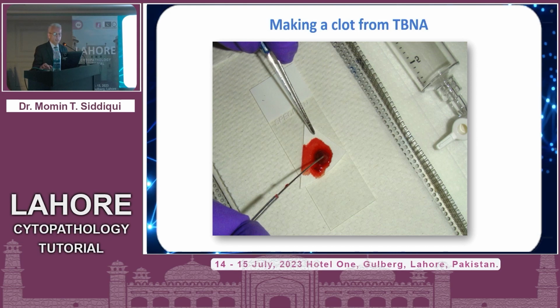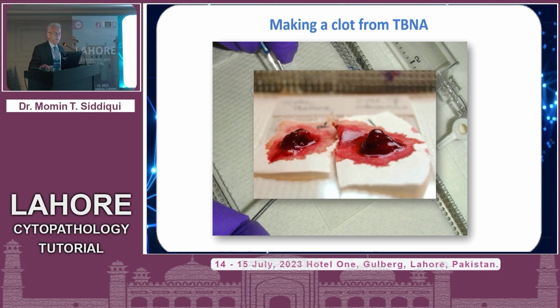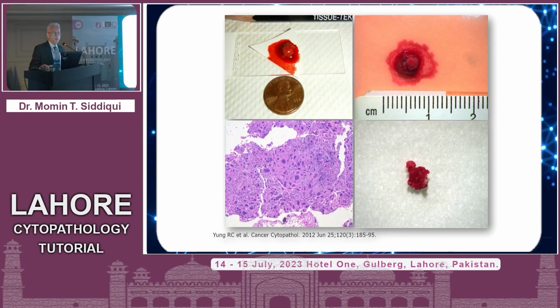And these slides, I've really been fortunate to get from Peter Ely at Hopkins. And what we do over here, even in our practice, is we collect each pass, the residue, as a clot. So pass 1, 2, and 3 collected on this filter paper here, it tends to clot, and you let this kind of stay in this position. And as the passes are given to you, you basically use 2 or 3 drops from each of those passes, and the rest of them are placed on the paper, and then you let it sort of air dry, and it basically forms a coin-like appearance over here. It really air dries, and then when you place this for H&E processing, this is what you're going to get out of it. So again, simple process.